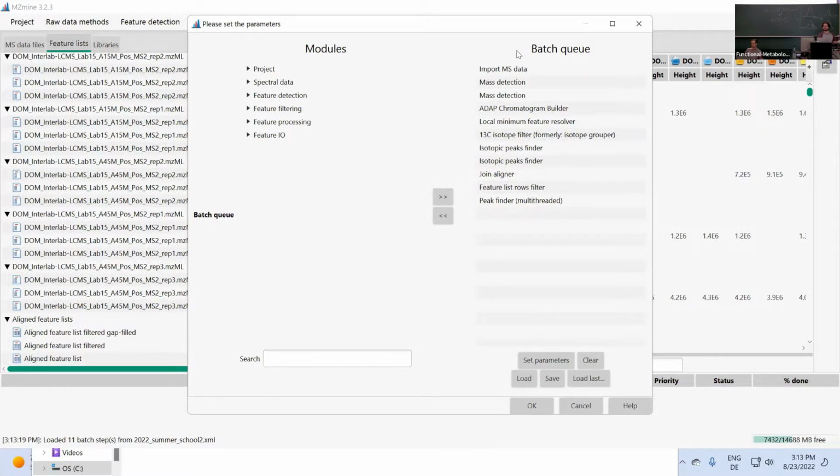And it's way easier to set up all the parameters and to add new steps to it. And so if someone failed to process their data set completely, you can get back to this step and just do it again later. And it's just going to take a few minutes, maybe 5, maybe less.